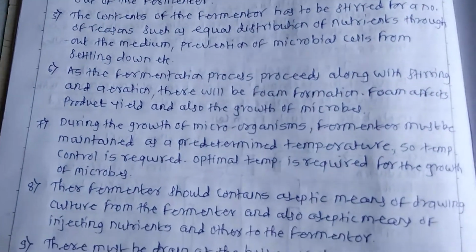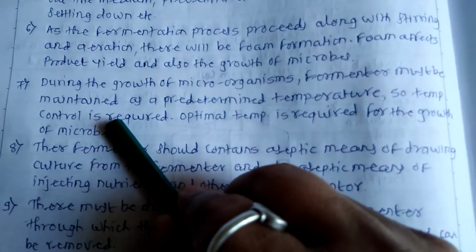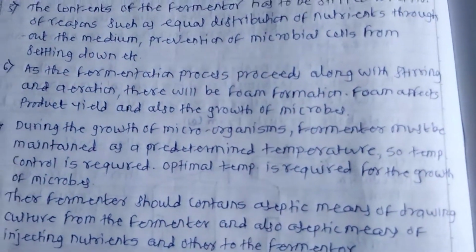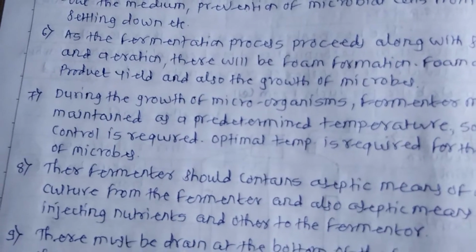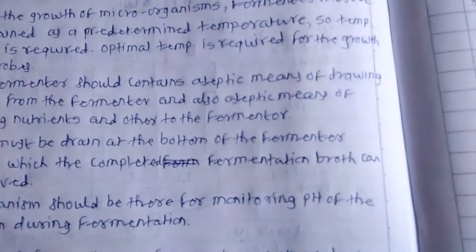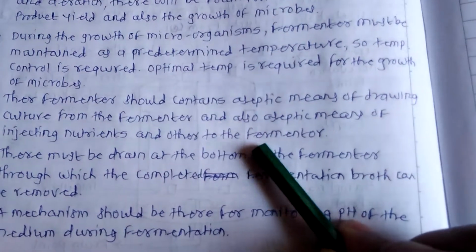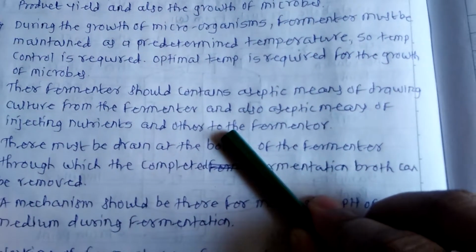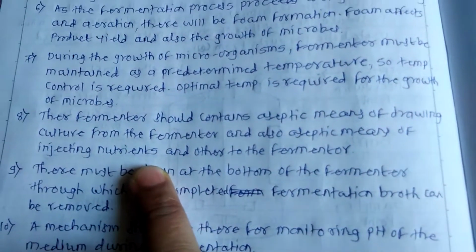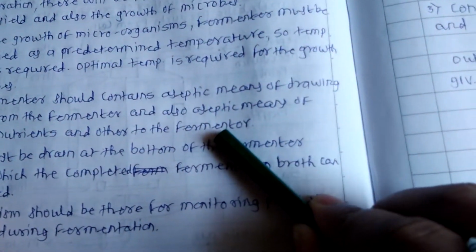Next property is that during the growth of the microorganism, the fermenter must maintain a predetermined temperature. The temperature required for the growth of bacteria is maintained by the fermenter. Then the fermenter must maintain aseptic conditions. Under aseptic conditions, the specific bacteria or fungi which work in that fermenter must enter the fermenter aseptically.